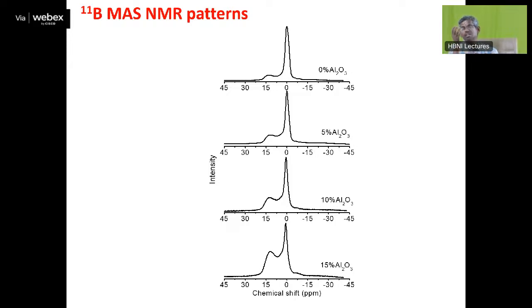So with additives in the glass, or if you use some different components to modify the structure, the boron NMR changes. So one can monitor the boron environment by doing this B11 MAS NMR. It will be very difficult otherwise, because boron is a low Z element. Once you go to low Z elements, diffraction techniques fail, particularly X-ray diffraction. So one needs to go to the NMR technique only to understand the relative changes in the boron environment occurring in any material.